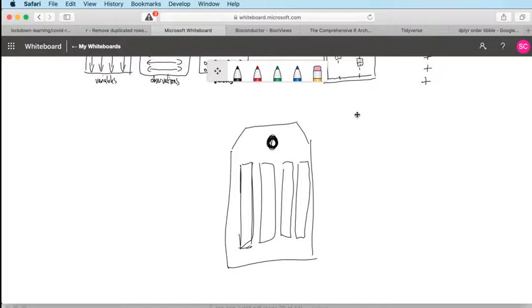The idea with these flow cells, and the thing that I've been trying to illustrate for weeks now, is that you have these 4 strips that go vertically down the flow cell. These are the lanes. These are your sequencing lanes. And on a HiSeq instrument, where you had 8 lanes on a flow cell, the lanes were all individually addressable, so you could load different things on each lane.